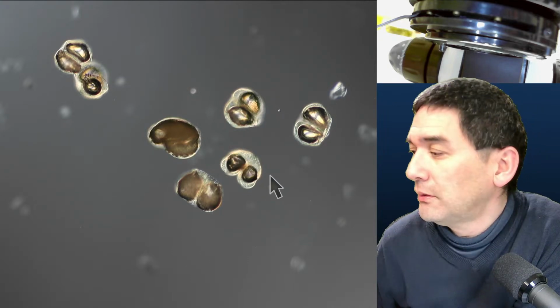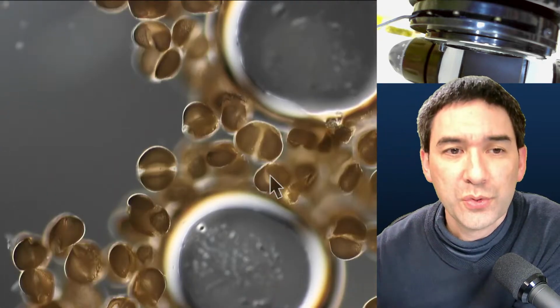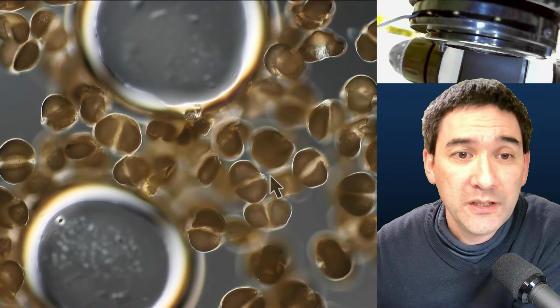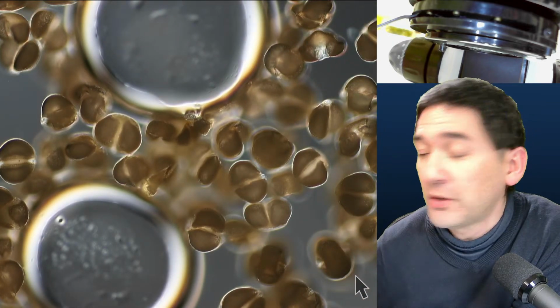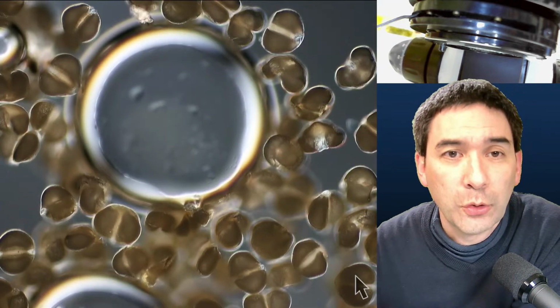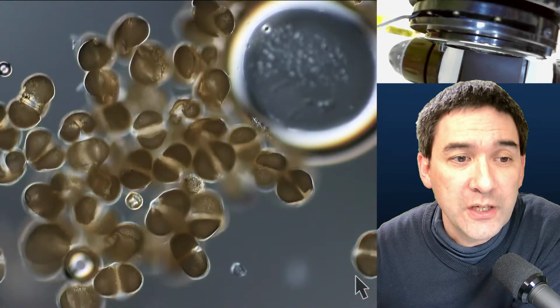So that's Eukitt. Usually Eukitt is used for mounting histological specimens, like, for example, tissue cross-sections and so on. It's a very popular mounting medium, of course, because it dries quickly. What I heard is that people who are mounting histological cross-sections for anatomical observations often use Eukitt.